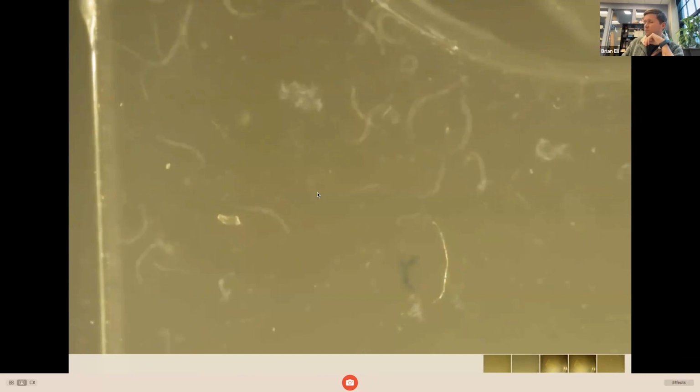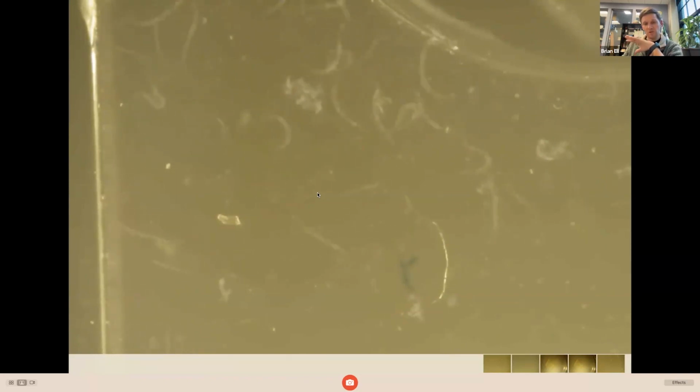There are also multiple wells in the counting chamber, so you can do replicates if you want as well. There's a lot of flexibility for how you want to do it, but we want to essentially pick just one worm and do the thrash count on that one worm.